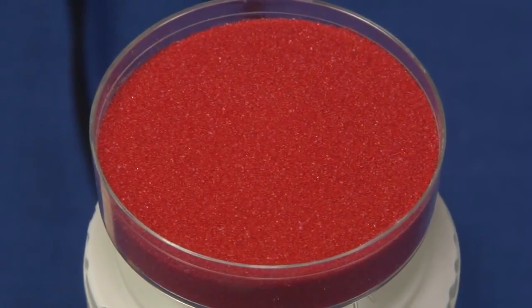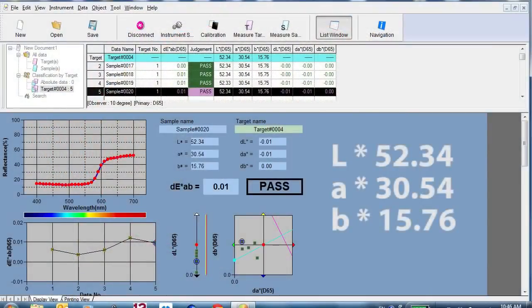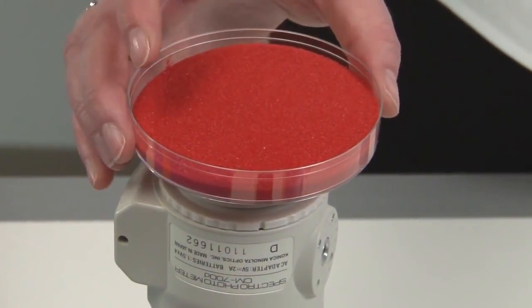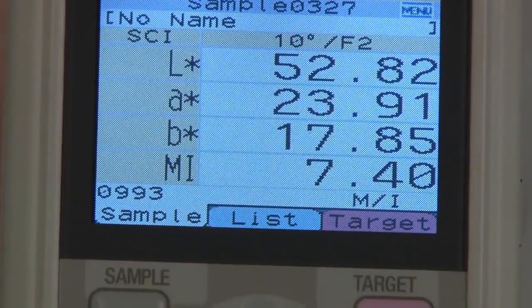In addition to improved efficiency, the CM700D's inter-instrument agreement allows users to communicate, share, and coordinate color values and specifications seamlessly throughout the supply chain.